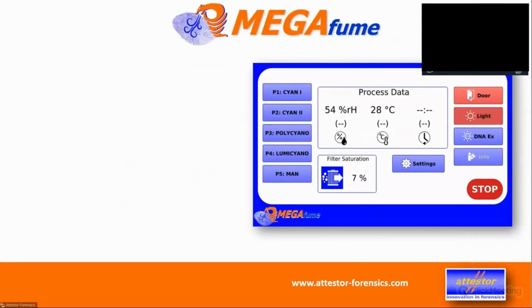Right, going into the display, that is how the display looks. I'll do that live in a second. What we have already made some experience with from our anhydrous chambers is these pre-programmed cycles, which you have here on the left. You have a number of pre-programmable cycles. For instance, we have named them cyanoacrylate 1, cyanoacrylate 2, polycyano, lumicyano, and there is a custom one as well. And then obviously there is also a manual one. Meanwhile, there is another one which is user definable.